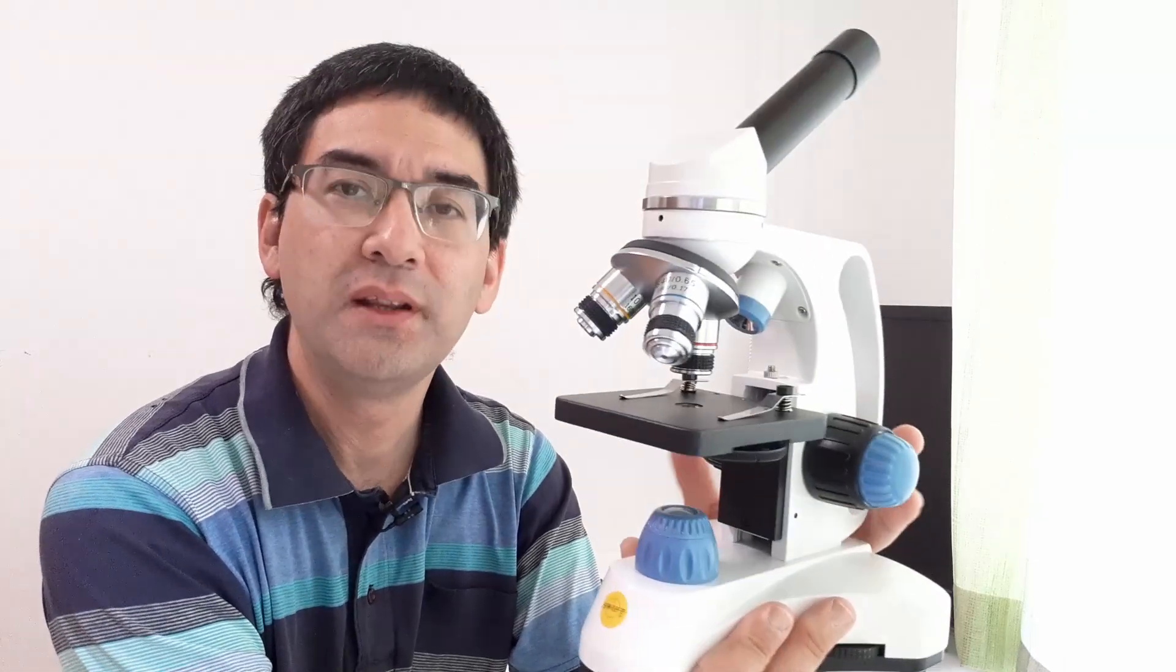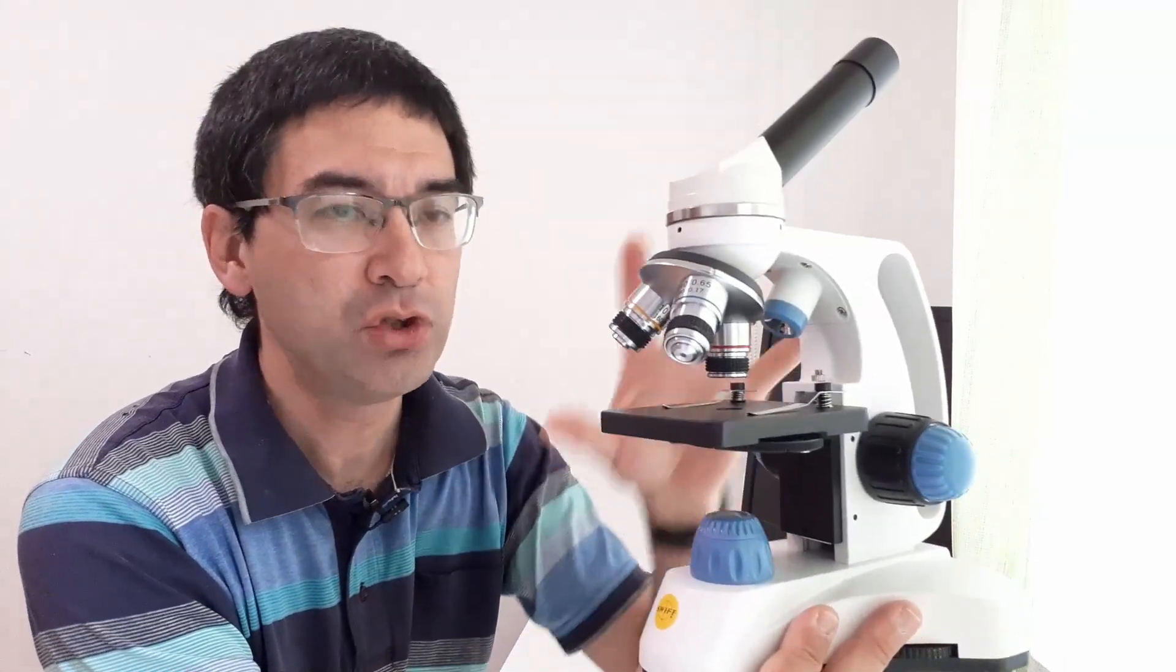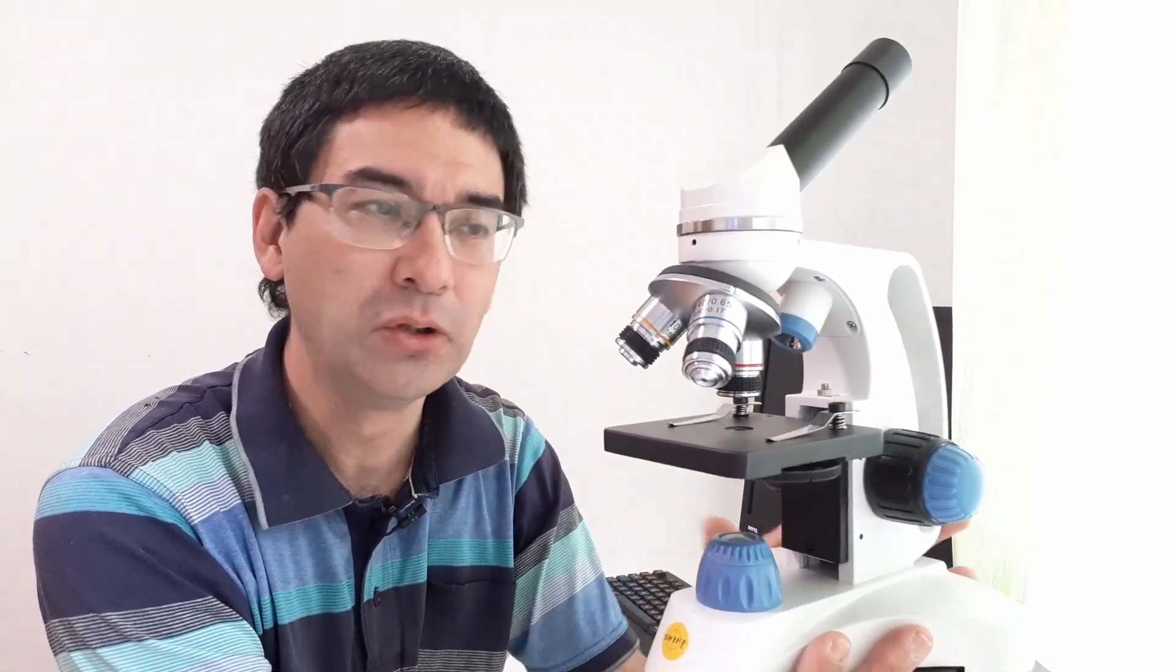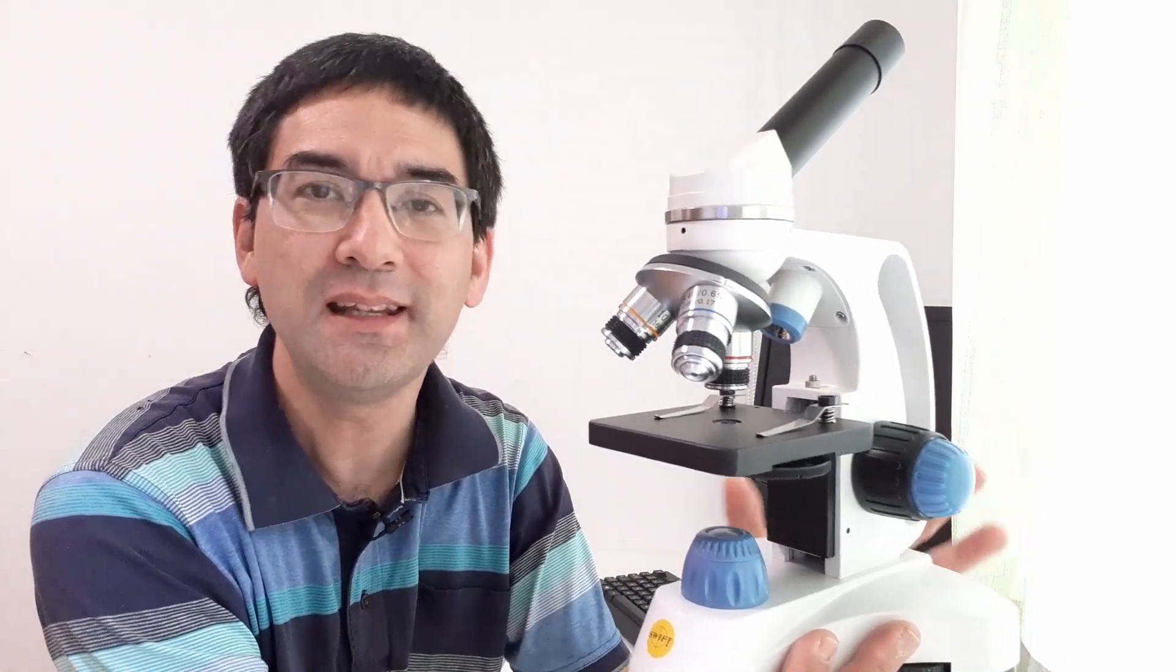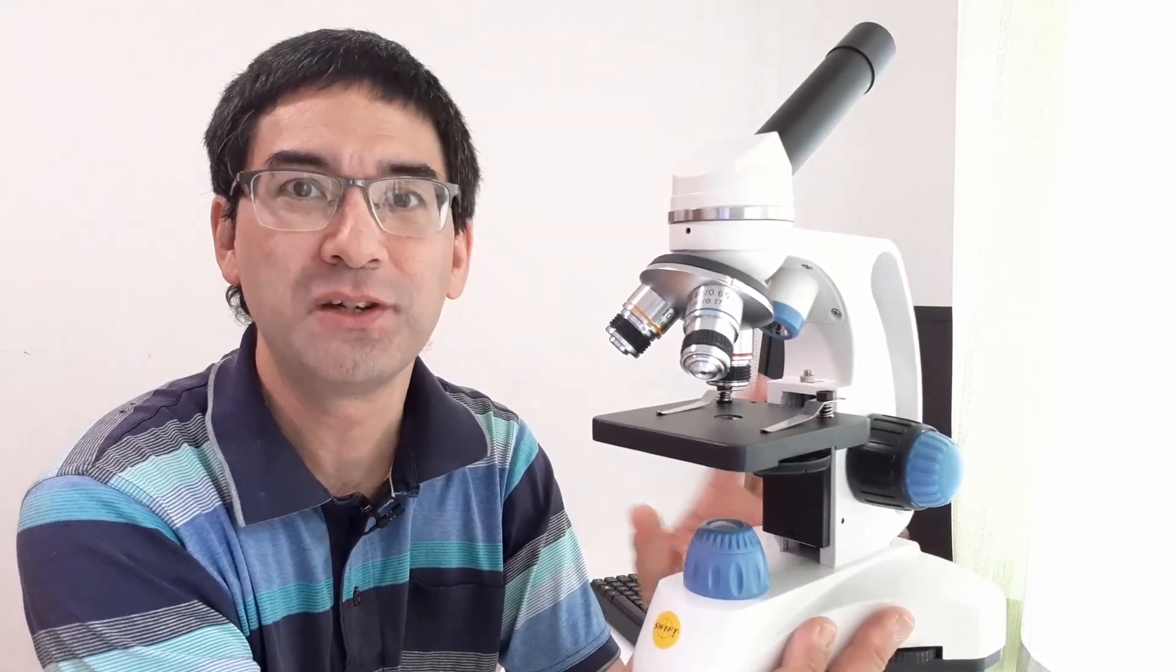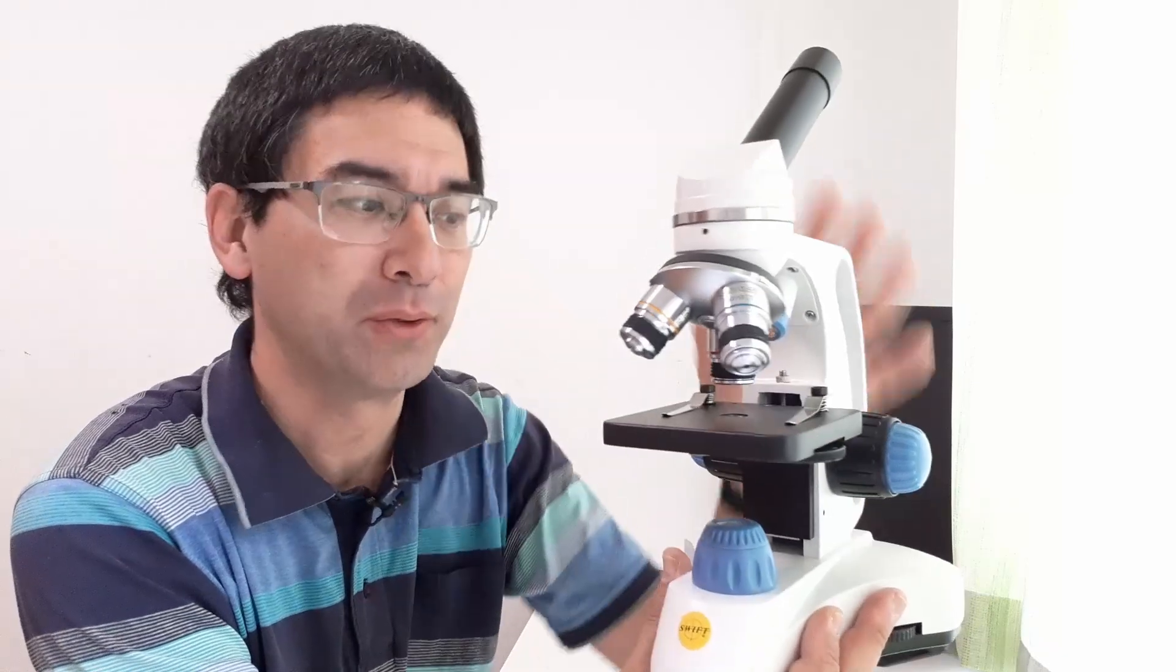What I would like to do in this video is give you first a general overview of the microscope, then later on I'm going to unpack it and we're going to have a more detailed look at the device. Then at the end I'm going to show you some of the images that I have taken through the microscope.